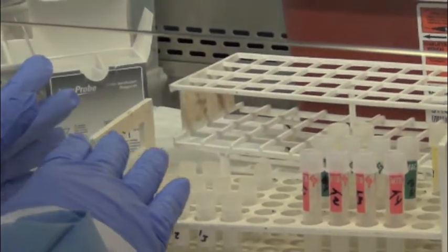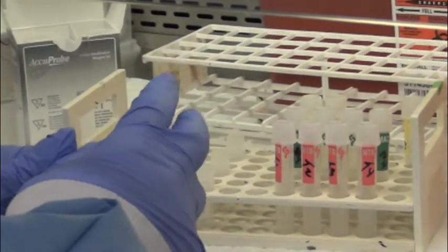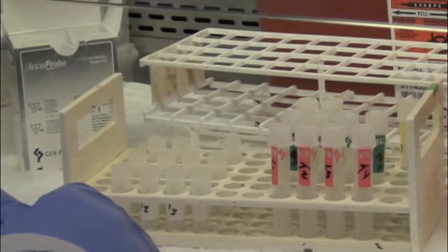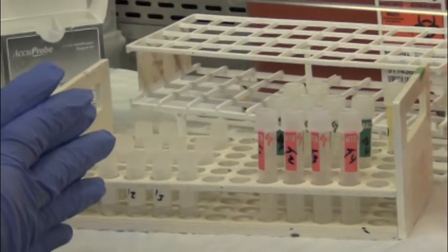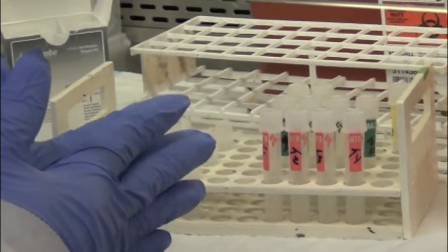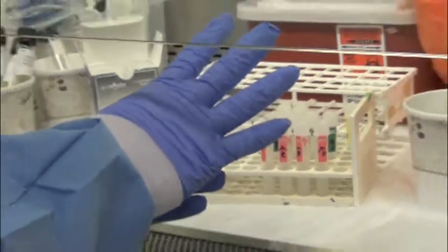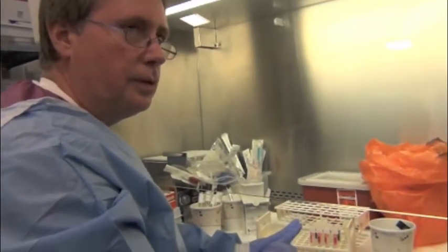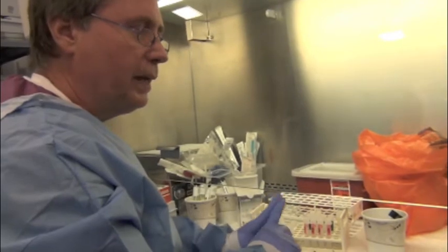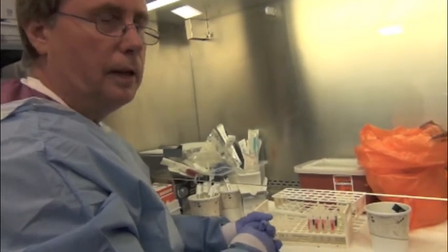It will form a complex with the single-stranded DNA. When we read it on the machine upstairs, a flash of light will be given off when the hybridization occurs and they bind, and then it'll give us a reading.